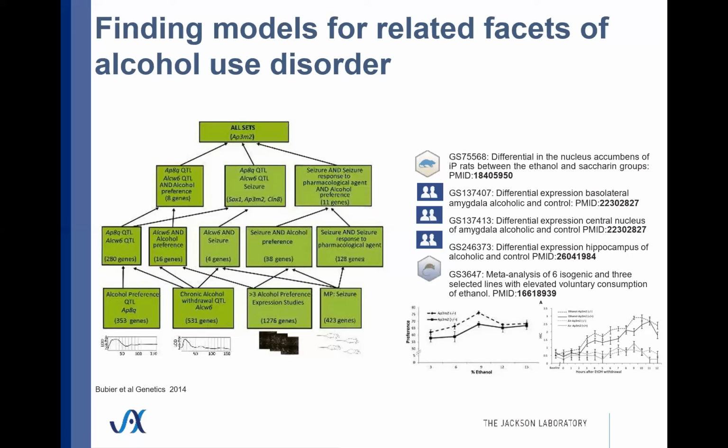And because we have multiple mouse genetic populations in this analysis, we can refine them and ask: is there any segregating variant that can account for this effect across multiple populations? And indeed there is. Although there isn't an enhancer variant in the human, there is a promoter variant. So again, as I said, you can traverse this variant graph to find the variants in one species that might act like variants in another species, even though there's very poor conservation of the regulatory feature.